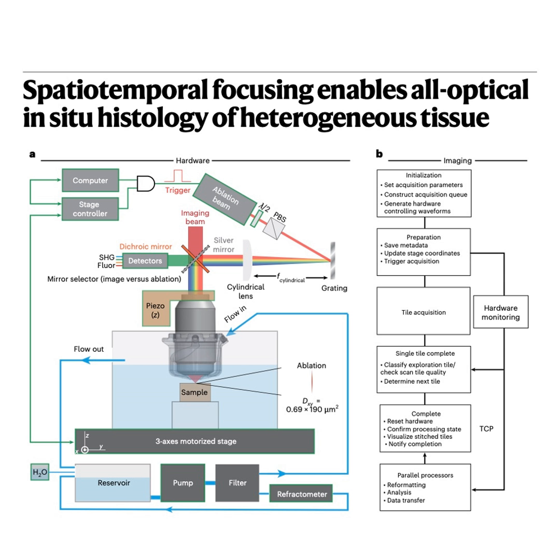The paper gives examples like gelatin, used as a soft tissue model, needed about 10 joules per square centimeter of laser fluence, whereas the rodent skull needed much less, only about 2 J/cm². The software uses the classification map to assign these material-specific machining parameters, voxel by voxel, or region by region. So it tailors the cut dynamically based on what it sees it's cutting. Millisecond by millisecond, potentially. It adapts the laser on the fly. That's seriously smart. Okay, so analyze figures out what to cut and how to cut it.